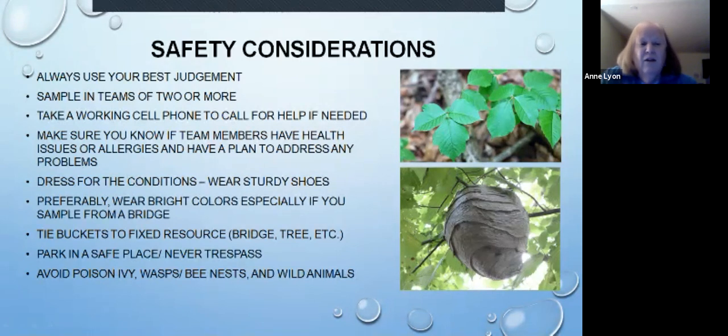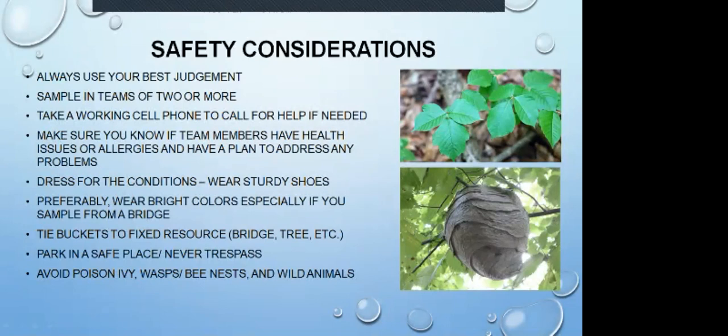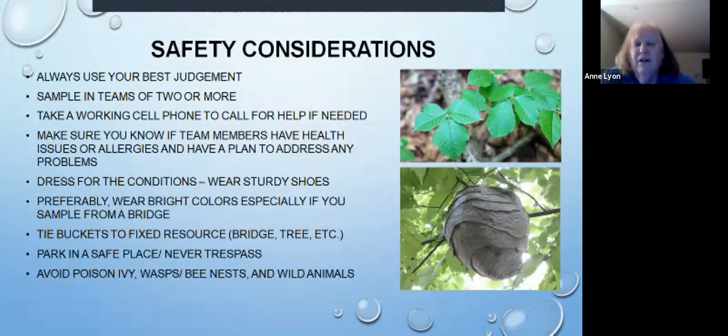We recommend you tie the buckets. If you happen to be one of the teams that drops the bucket from the bridge, we recommend you tie the bucket to something on the bridge before you toss it overboard. The reason is that sometimes when that water hits your bucket, it can make a big tug, and you can let go of your bucket and it'll end up downstream. So this assures that you don't get the bucket pulled right out of your hand. We always recommend that you park in a safe place and that you never trespass. Most of the places we monitor are public places.